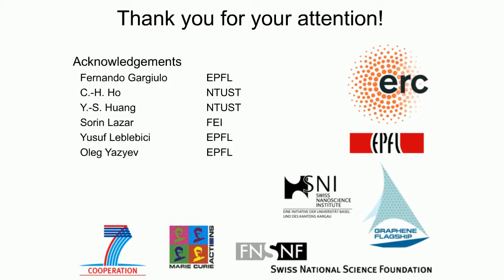So one of the questions, and I think this is for Keith, is: when KPFM is done on a 2D material, do the results depend on which substrate it's lying on, and if so, how? Yeah, so that's an interesting question. It really depends on, initially, to first order, how it's mounted.